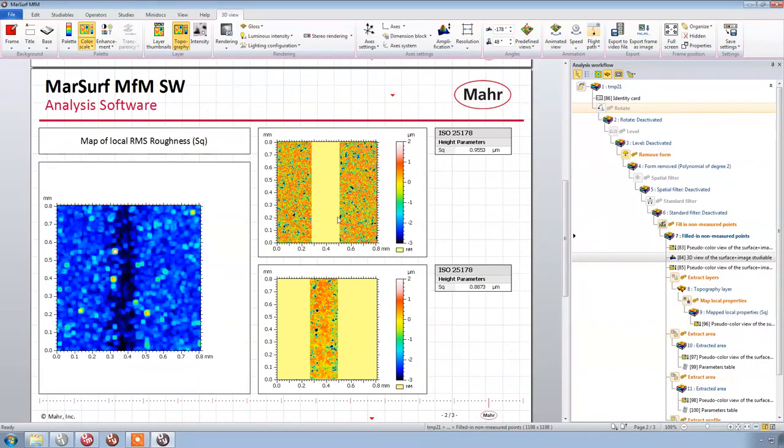And then I went and I did the opposite. So I cut out everything except for the pencil area, and I compared the RMS roughness there. So not a huge difference, but definitely a quantifiable difference, about 80 nanometers difference in roughness on a 1 micron. So about a 10% difference in the roughness between the two areas. Why is that important? The point here is simply that we can't really see a height difference there.